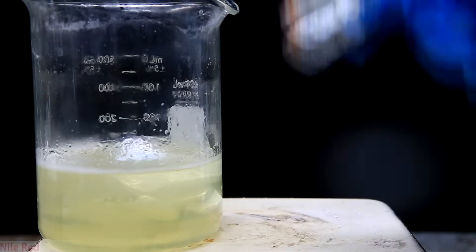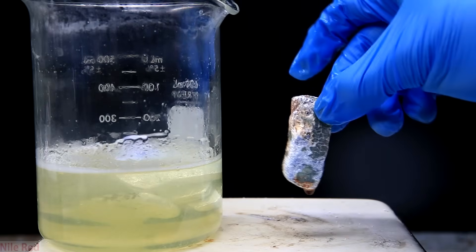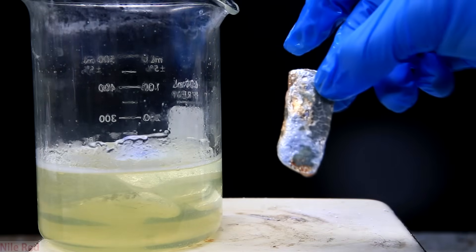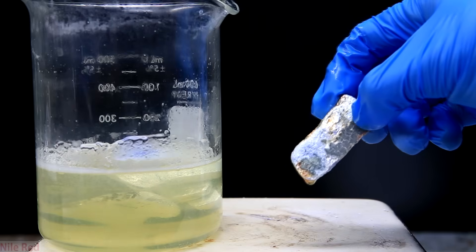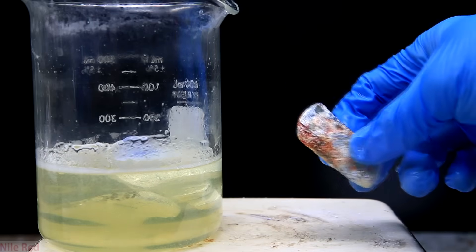After a while this solution becomes yellow as well and if we take out a piece of potassium and hold it in air a bunch of red stuff appears. You can see that this piece has a lot of red on it, but when it's placed back into the toluene isopropanol mixture it immediately disappears.